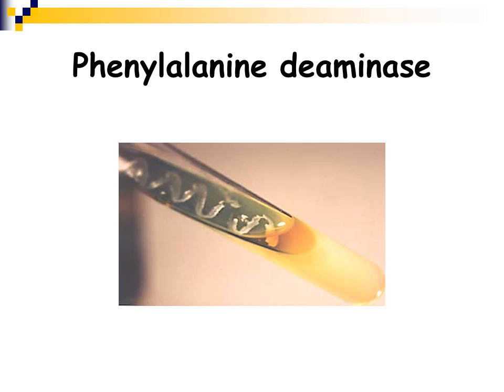So here is a phenylalanine deaminase agar slant. You inoculate the organism along the slant. You can see the wave pattern of the organism growing along the slant. After overnight incubation, you'll remove that slant. You can see growth on the slant. You add the ferric chloride reagent, and the slant will turn a nice green color if the organism is PDA positive.